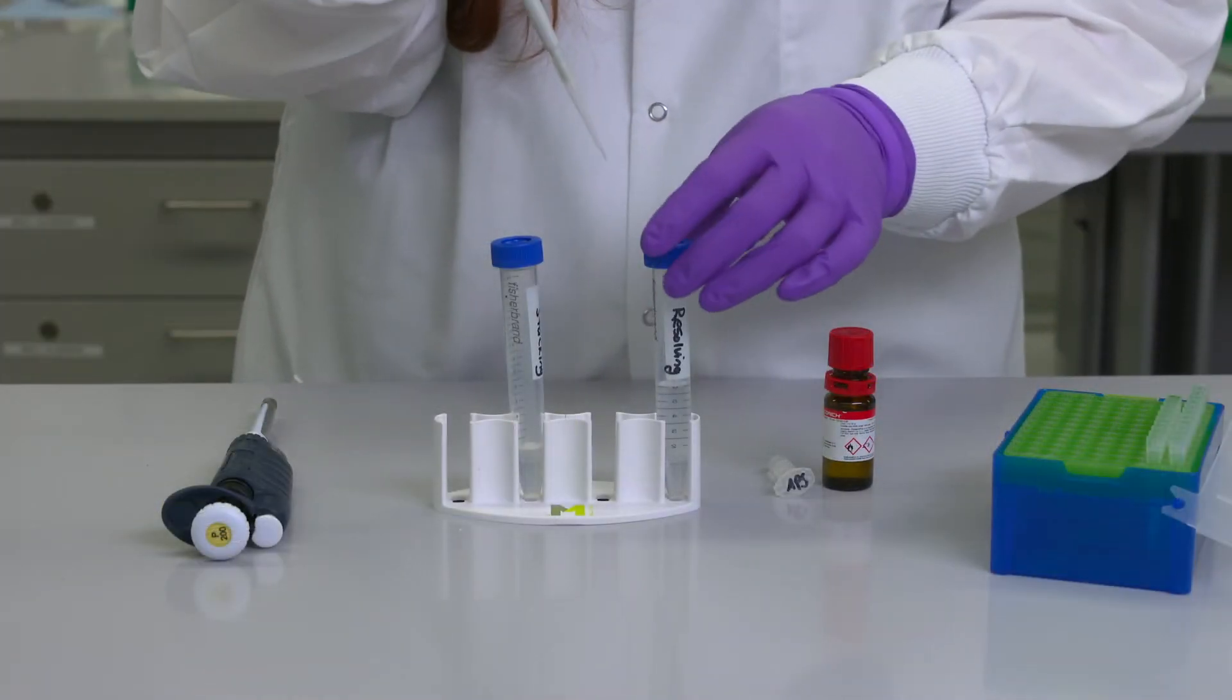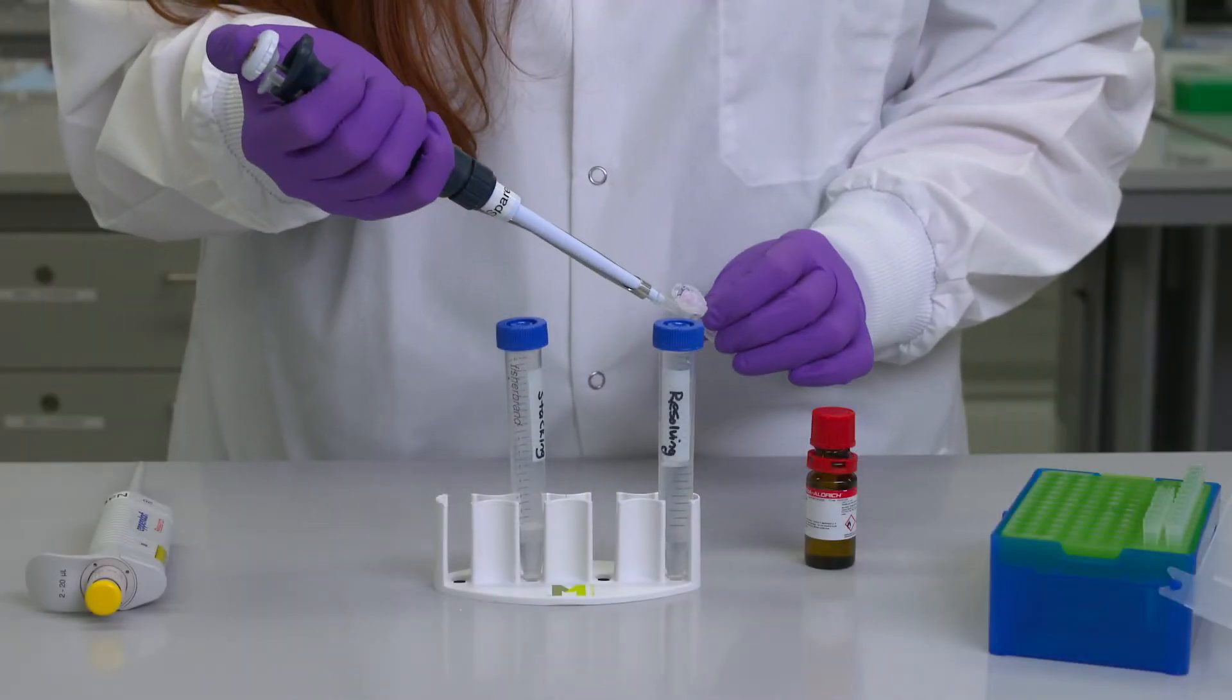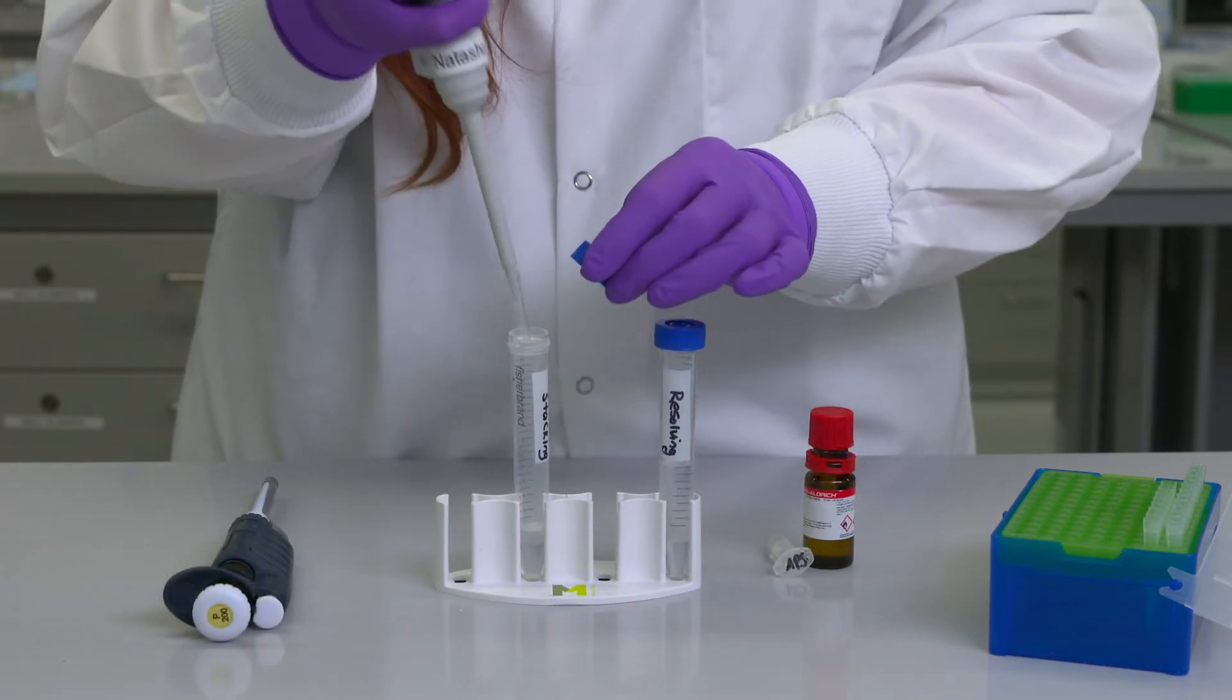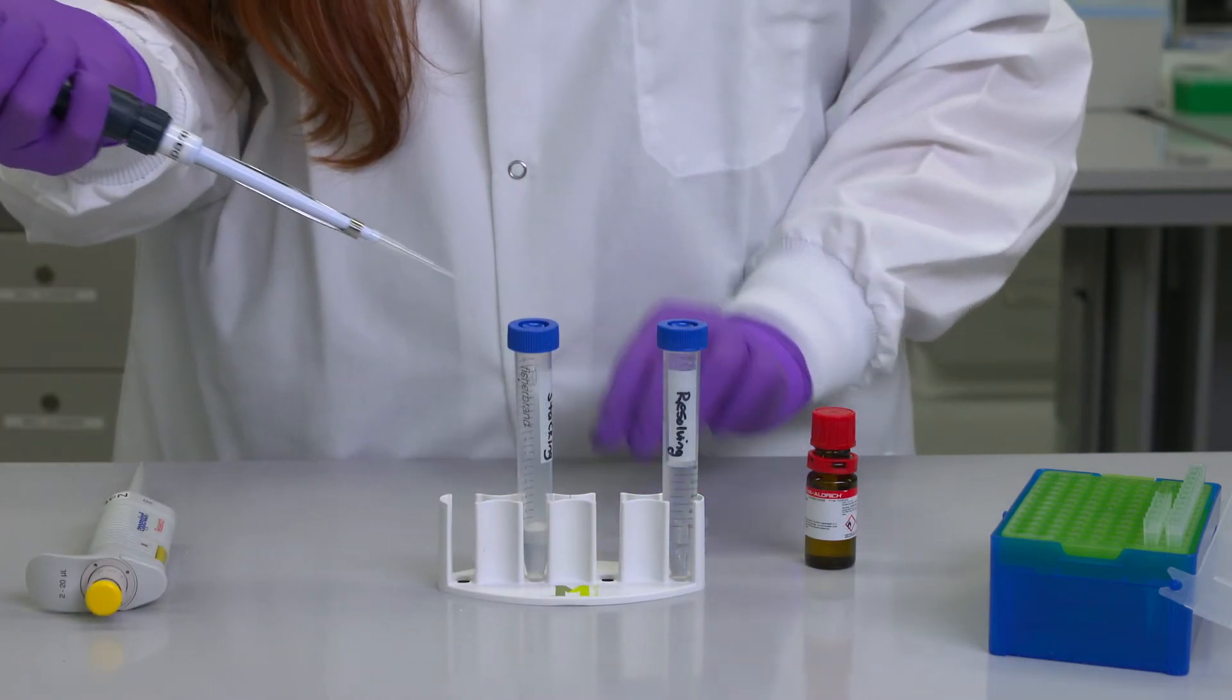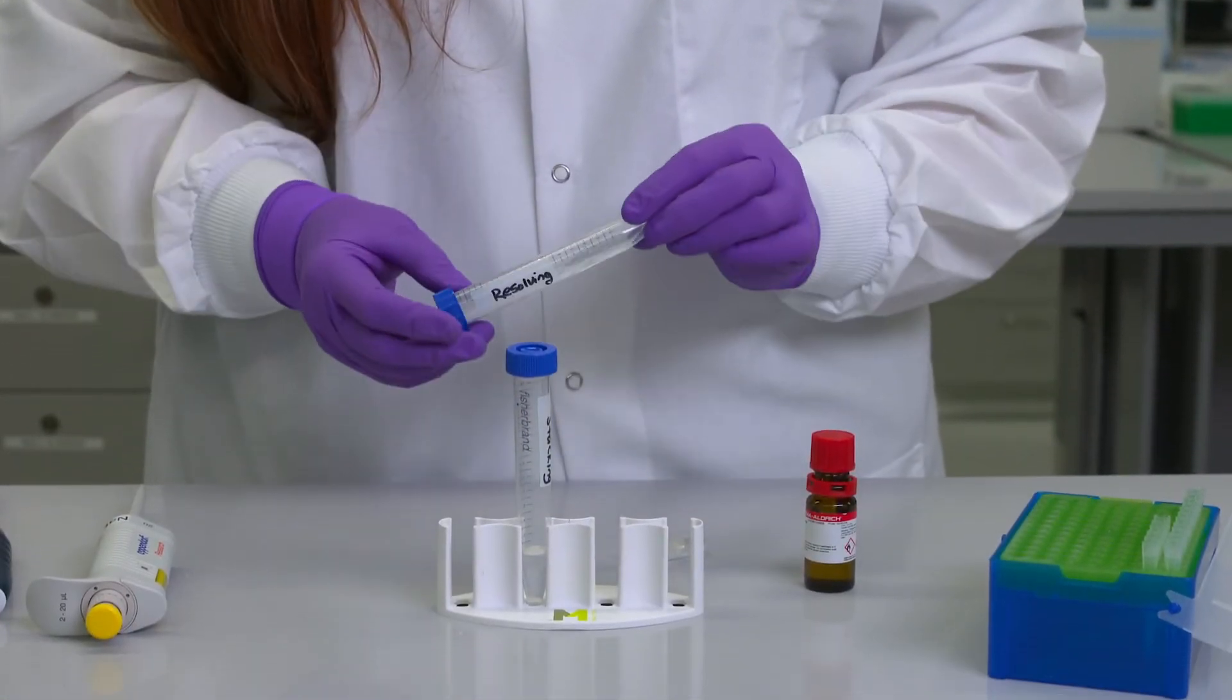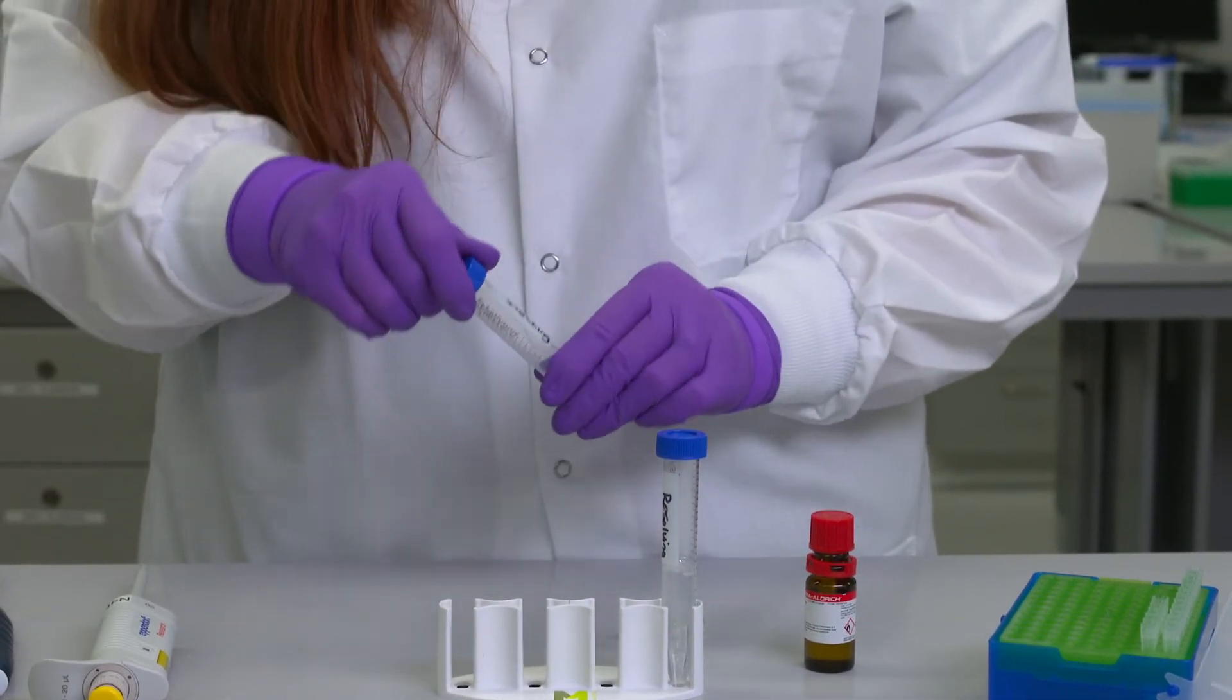Next I'll add 3 microliters of TEMED and 30 microliters of APS to the resolving gel, and then add 2 microliters of TEMED and 20 microliters of APS to the stacking gel and mix both solutions by gently inverting the conicals. Try to avoid introducing air bubbles while mixing.